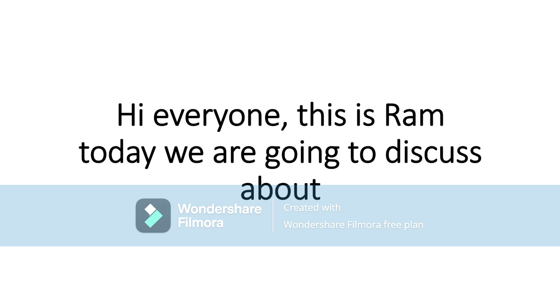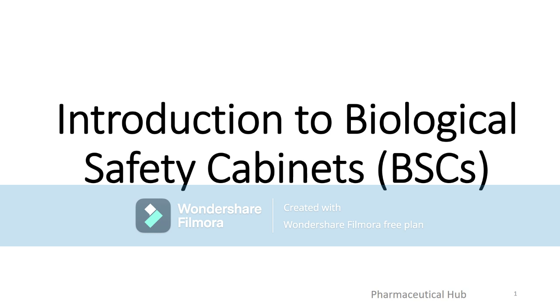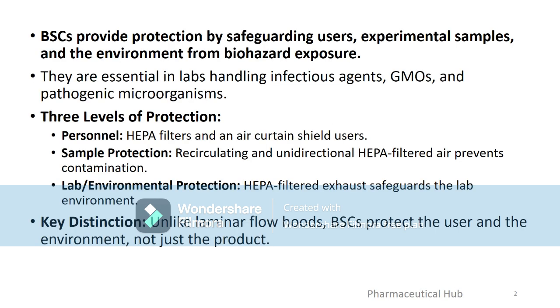Today we are going to discuss Biological Safety Cabinets, BSCs. Slide 2. Introduction to Biological Safety Cabinets, BSCs. BSCs provide protection by safeguarding users, experimental samples, and the environment from biohazard exposure. They are essential in labs handling infectious agents, GMOs, and pathogenic microorganisms.